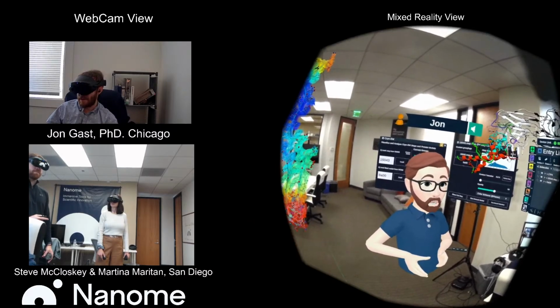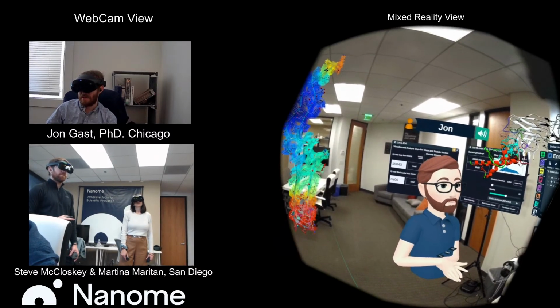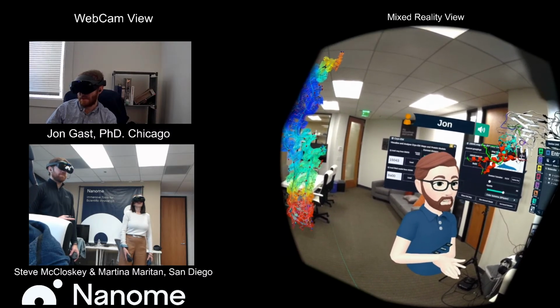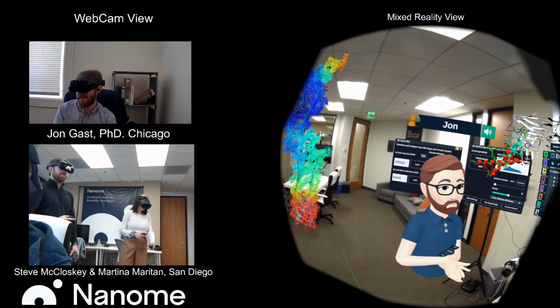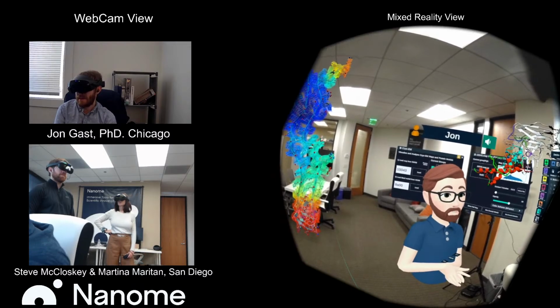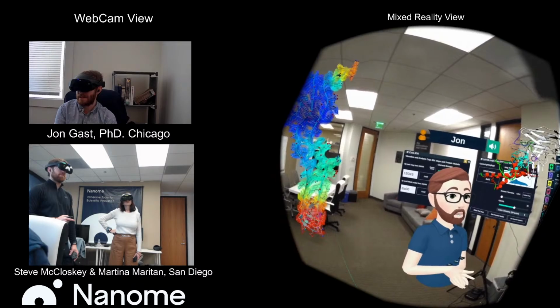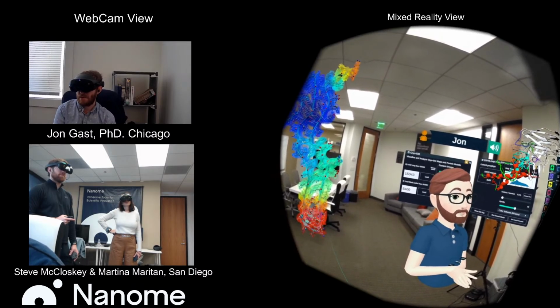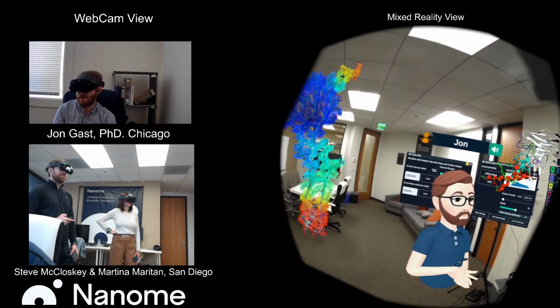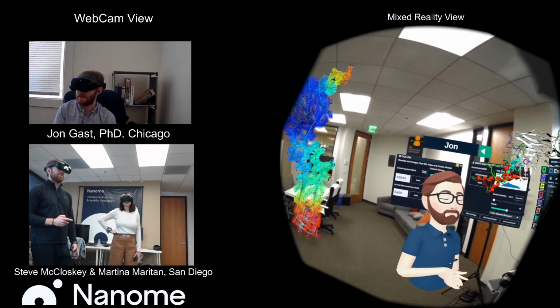I've loaded things that are, I need to look up the exact number of Daltons, but I've been bringing in very, very sizable things. For the really large ones, they'll take more than a few minutes, but not very long. Definitely less than an hour, less than 30 minutes. You just start up the plugin, set up the map, and the protein loads in very quickly. It's really just the map that we have to render all the surfaces for and prepare.